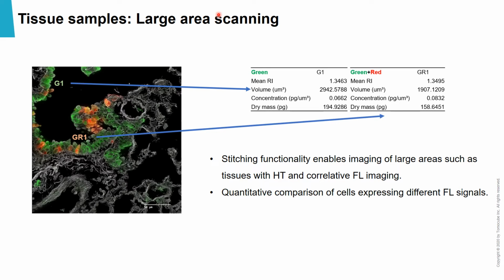We can see in HT and also in fluorescence or with both combined. Normally, if you want to see in fluorescence, you could use confocal microscopy, but to see it together without fluorescence, previously you would have had to stain the sample with H&E.